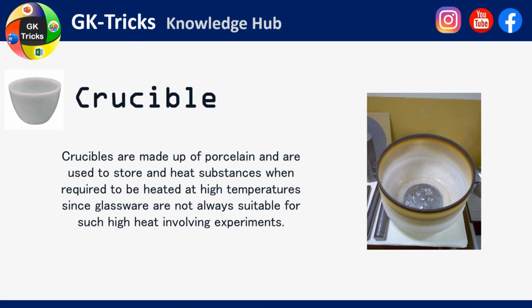Crucible. Crucibles are made up of porcelain and are used to store and heat substances when required to be heated at high temperatures, since glassware is not always suitable for such high heat involving experiments.